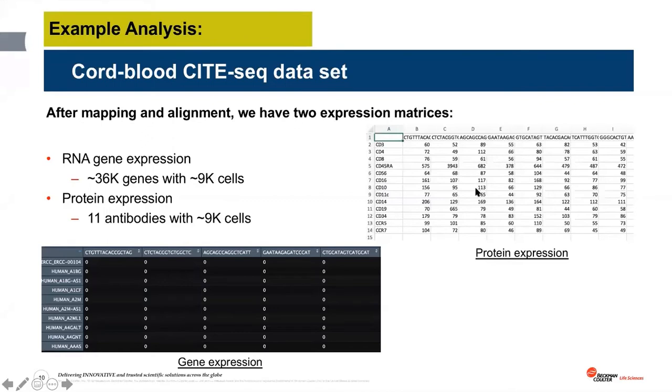And the other thing you might notice is that if you look at these values, they are all integers. This is one difference between the sequencing technology and the cytometry technology. For cytometry technology, you will get real numbers, which is like analog information from reading the fluorescent intensity during the data acquisition process. But for sequencing data, you will get digital counts, and you will get integer numbers.